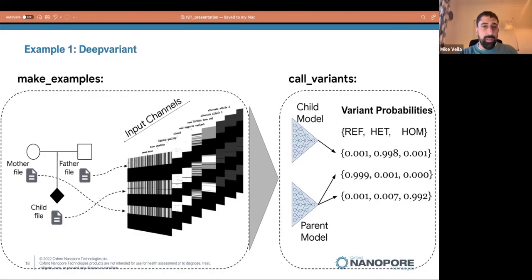This is a tool developed by Google Brain in 2017, and it is a tool for identifying genetic variations in DNA sequencing. When I talk about DNA variations, what exactly do I mean? You might hear someone has a particular mutation in their DNA or a particular variant of DNA. This is kind of interesting because each person has their own genome, and what does it mean to have a variant?